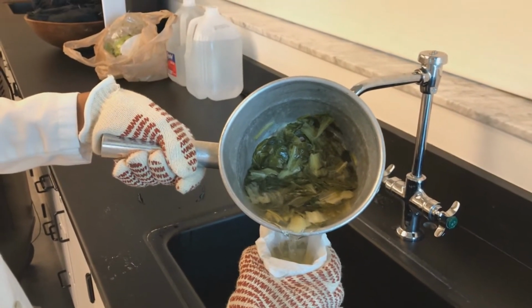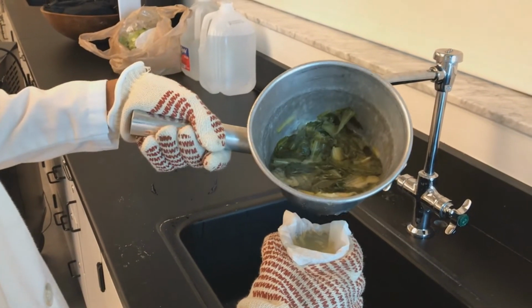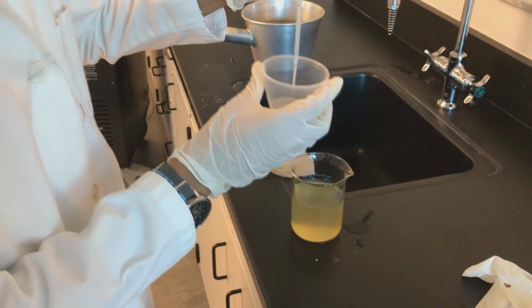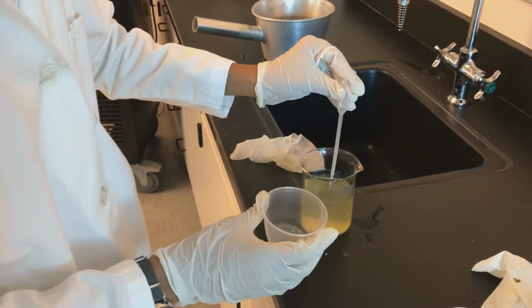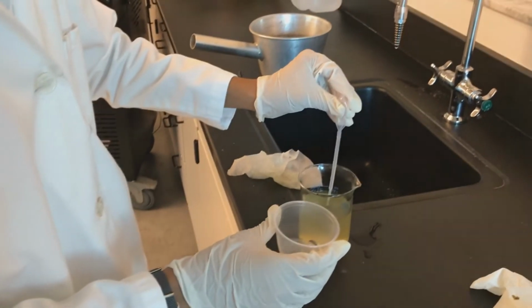Next, the contents of the pot were strained through a coffee filter into a beaker in order to separate the iceberg lettuce from the nutritious liquid. Using a pipette, 10 milliliters of lettuce water were then placed into each of 4 plastic cups. The pipette was then washed out using distilled water and dried.